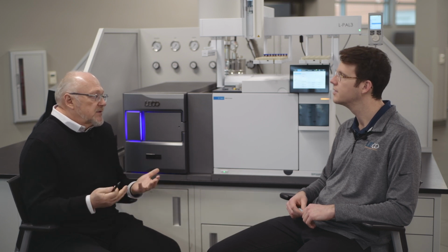introduced into the mass analyzer. So that's a very efficient way to generate ions, and it's an open source by definition, which means that there's a minimum interaction of ions and analyte molecules with surfaces in an ion source. So that helps to maintain the integrity of mass spectra, so-called classical mass spectra.